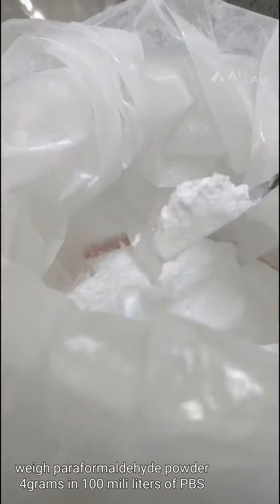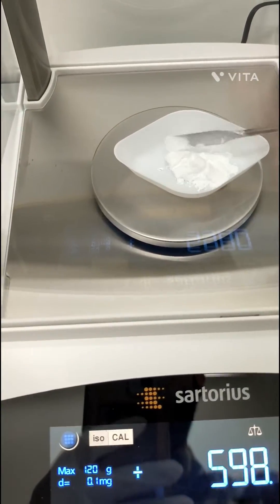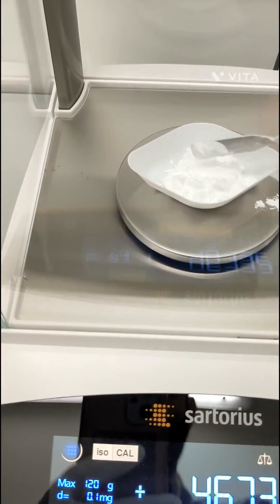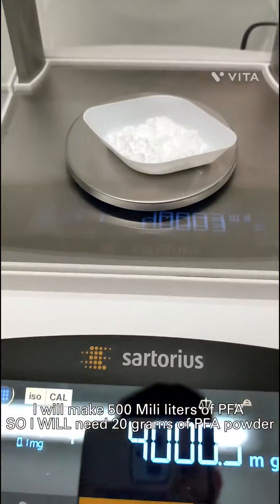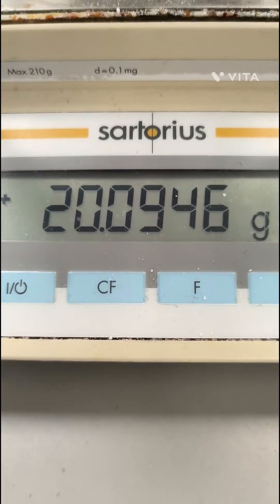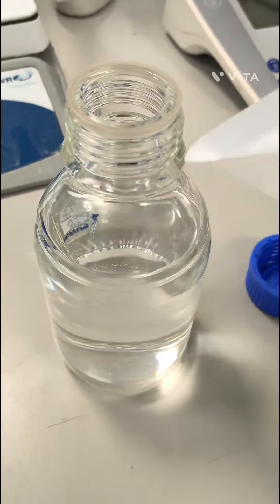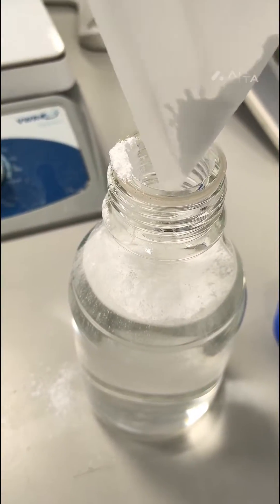Weigh paraformaldehyde powder. I will make 500 milliliters of PFA, so I will need 20 grams of PFA powder. Now I will add PFA powder into the PBS bottle and make a final 500 milliliters of 4% PFA solution.